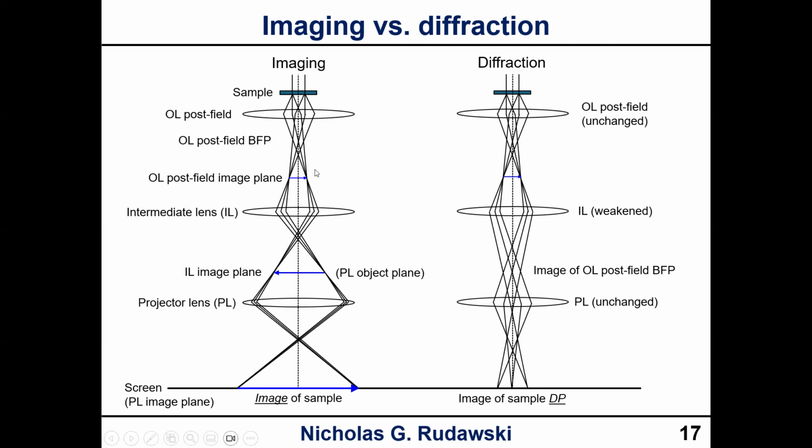Your objective lens, believe it or not, in terms of its magnifying capability, is really not as impressive as you might think. I think it's only on the order of something like 50 to 100x. So it's not as strong as you would think, just in terms of its magnifying power, even though it is the most important lens in the microscope.